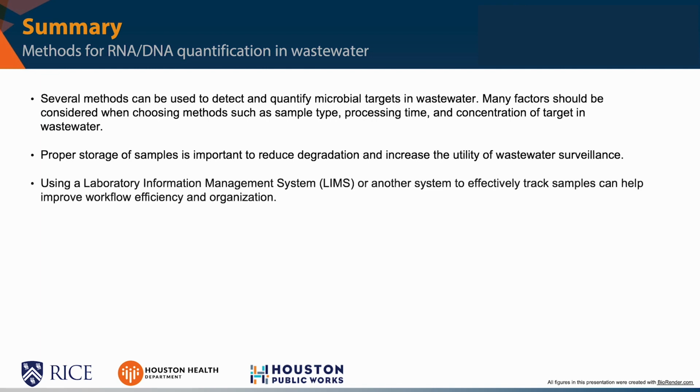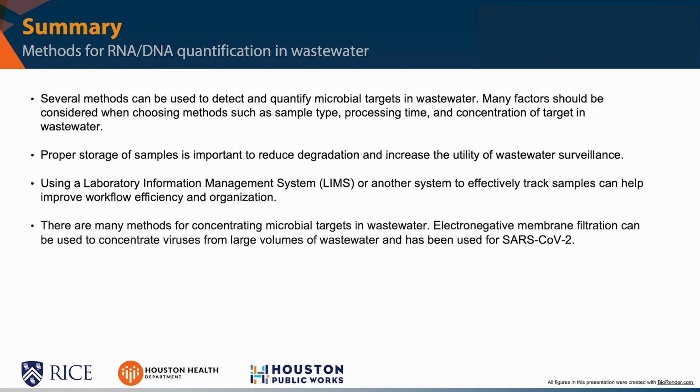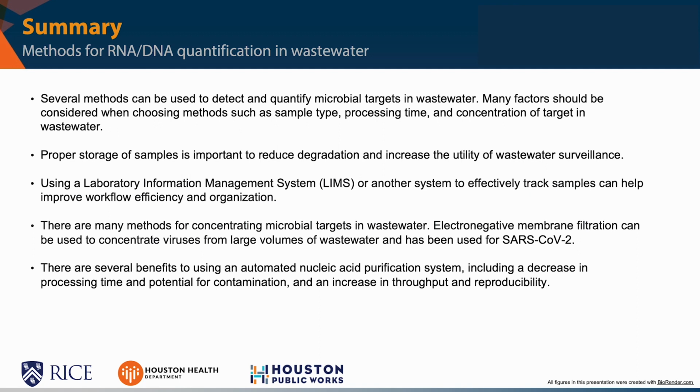The use of a laboratory information management system or another system to effectively track samples can help improve workflow efficiency and organization. Electronegative membrane filtration can be used to concentrate viruses from large volumes of wastewater and has been used for SARS-CoV-2. There are several benefits to using an automated nucleic acid purification system, including a decrease in processing time and potential for contamination, and an increase in throughput and reproducibility.